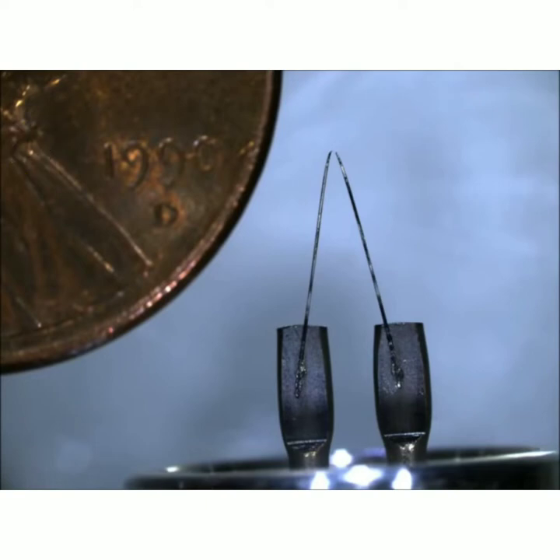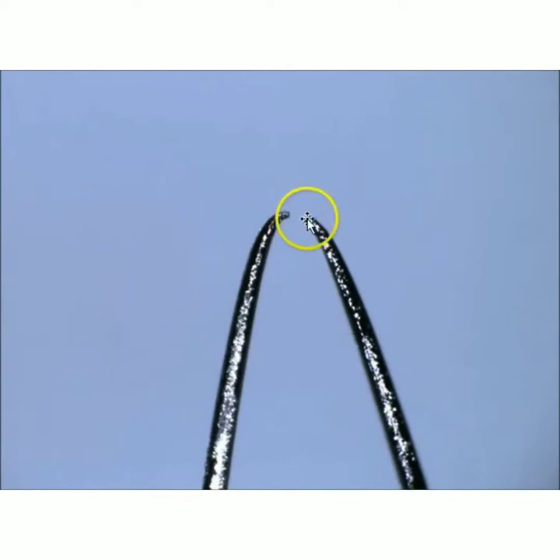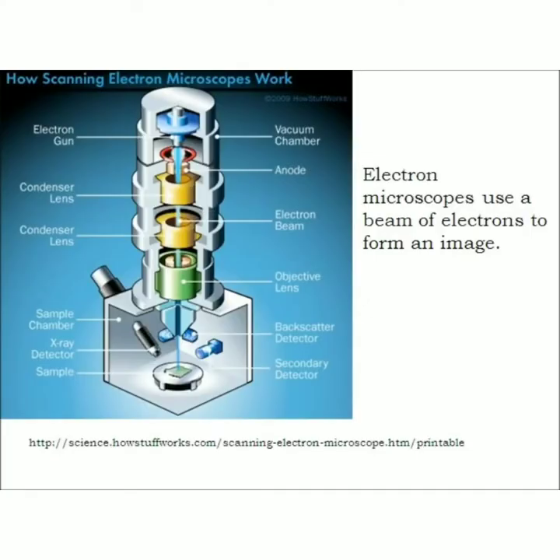By the way, just to show you a nice image from the Leica here, you can see that this filament's actually burned out. So this wears away as we use it. We put 15,000 volts through there, or on the big scope we'll put up to 30,000 volts through this filament, and it eventually burns away. Alright, so let's go back and look at our cutaway again.